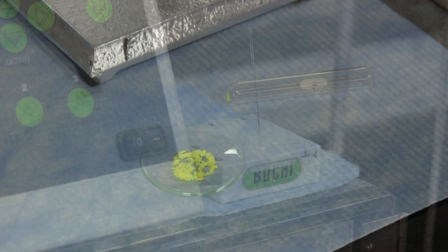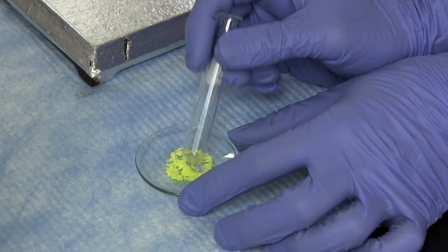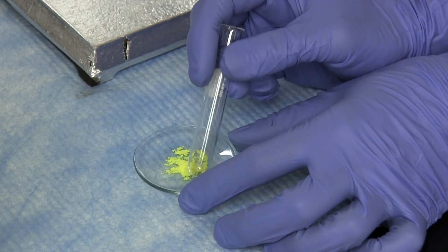If the solid sample is too granular, packing into the capillary tube can be made easier by first lightly crushing it using a test tube and a watch glass.